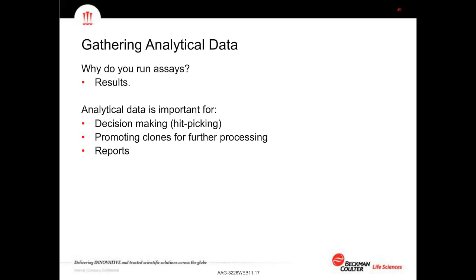As we add new devices to a system, the modality that we use today is not the same reader that we were using 5 years ago. The technology when it comes to cell culture data gathering changes year to year. And so we need to have some way of adding new devices to the system. Likewise, there's no one endpoint reader which gives us all the results that we need. And we'll look here in a minute as to how we can do hit picking on multiple different inputs as we combine the information from 3 different readers.